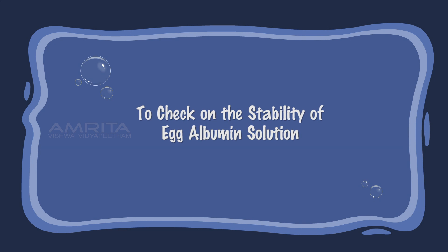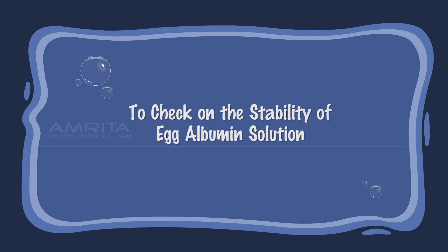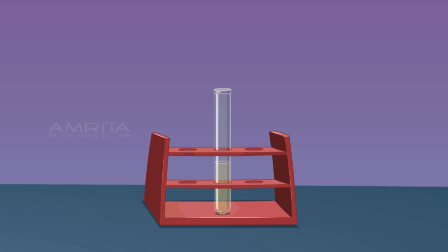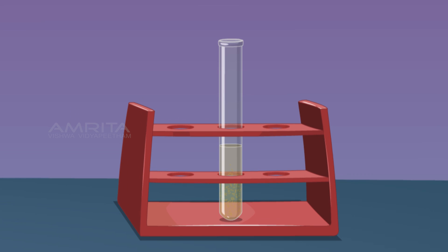To check the stability of the egg albumin colloid, take some colloidal solution of egg albumin in a test tube and leave it in the test tube rack for 20 minutes. No change is observed. This indicates that colloids are stable and their solute particles do not settle down even after the lapse of time.